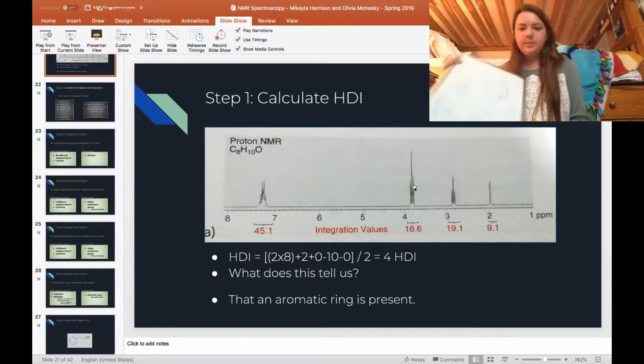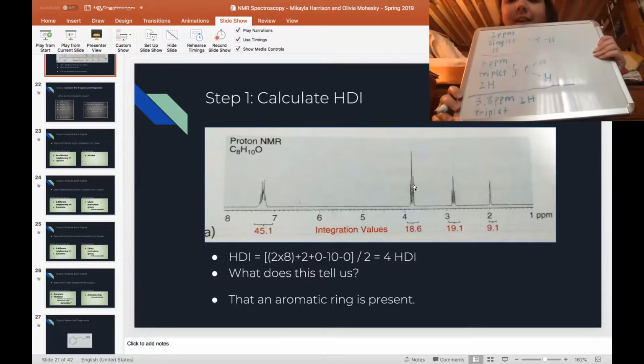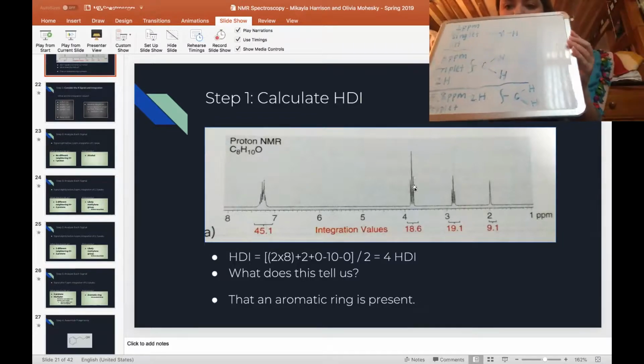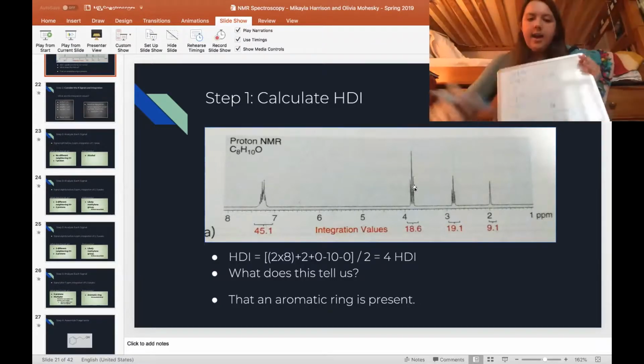So looking at this one, it looks pretty similar to the other one. The only difference is that the shifted values are further down. So I'm going to again think that this could be a methylene group. I'm just going to draw it out. You can see it at the bottom there. There are all my fragments so far that I think I have.